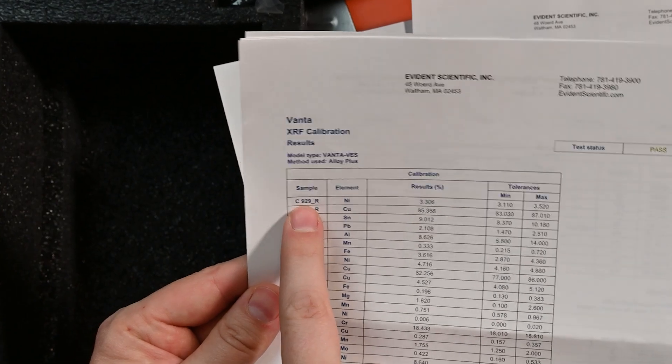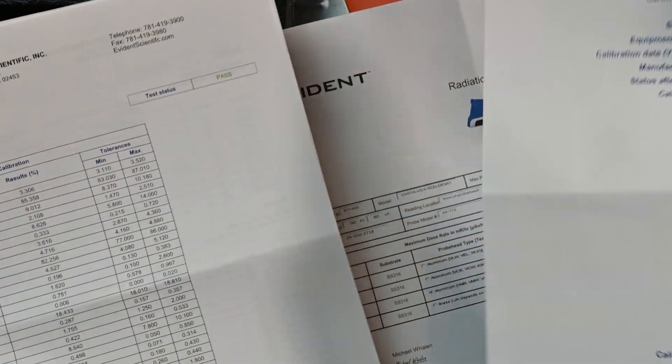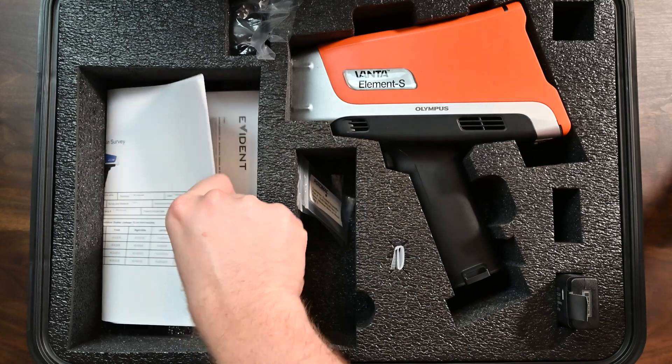A certificate of calibration is going to tell you what samples were used and what elements were read when they did the calibration for this instrument. So if you have any questions, or your quality department wants to take a look at it or needs it for the file, it's right there.